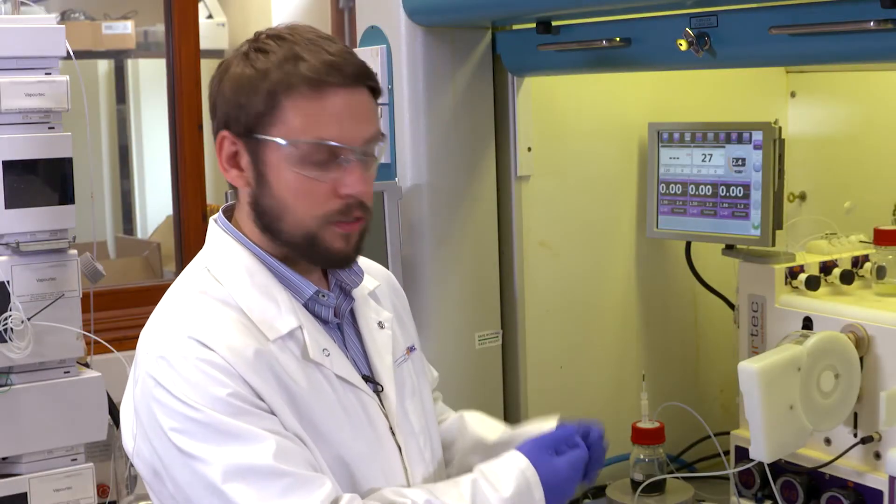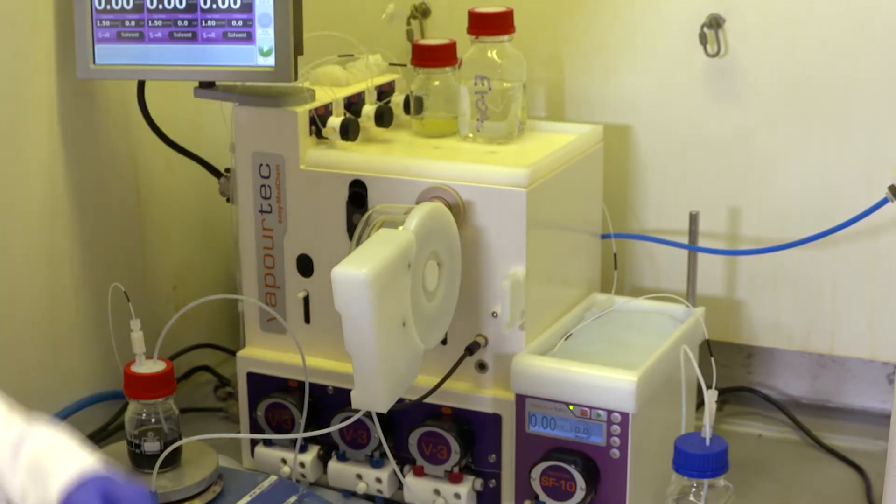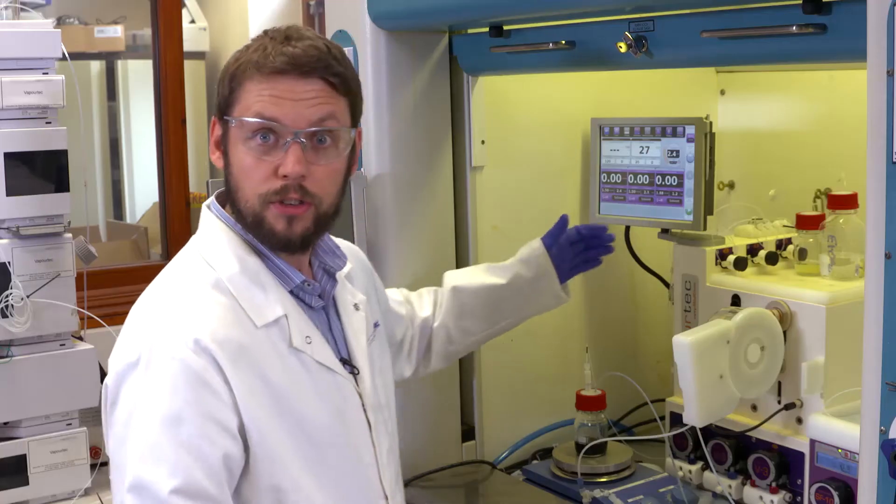I'm going to be using an E-Series and I'm using an SF10 as a back pressure regulator. So I've got my reagents and my system solvent ready on the system and I have the slurry ready. I just need to prime the pump.